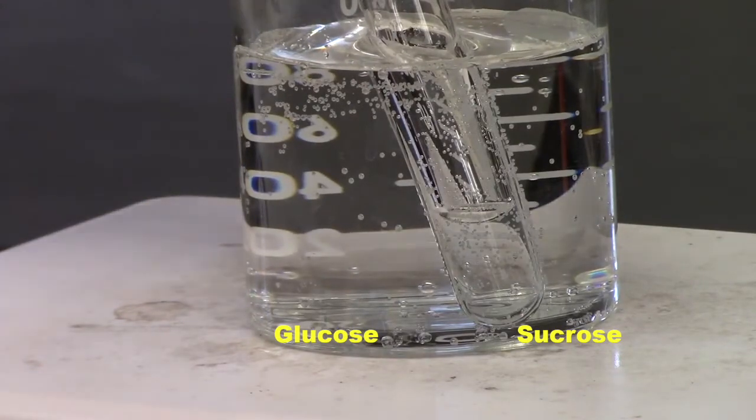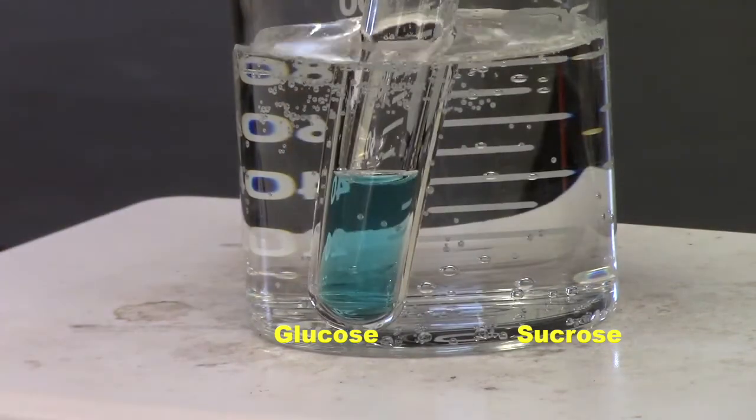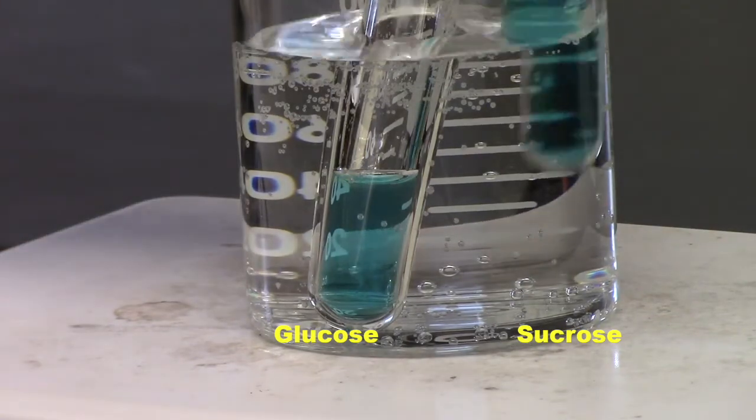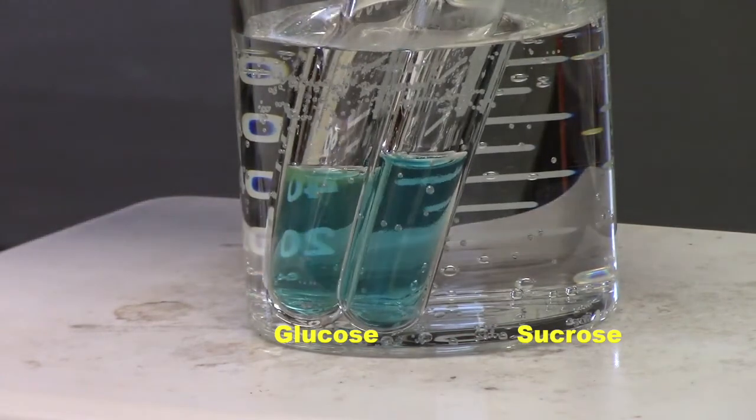There we go. Put it in the heat. Now I'm going to warm this bath. It's warming up now. I want it to kind of get close to boiling, if not boiling. We may see the result before boil, though. Let's keep that in mind. All right. There. Now we're just going to let them sit in the solution.